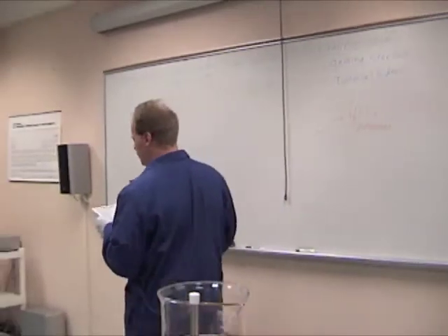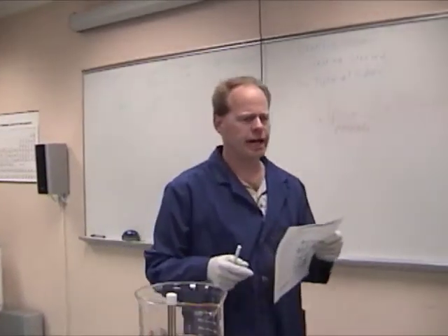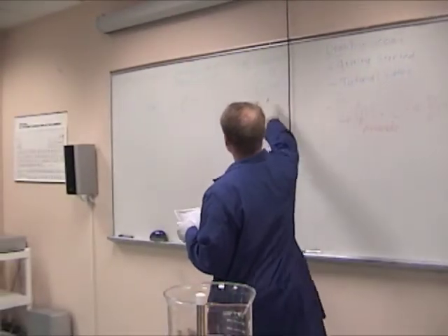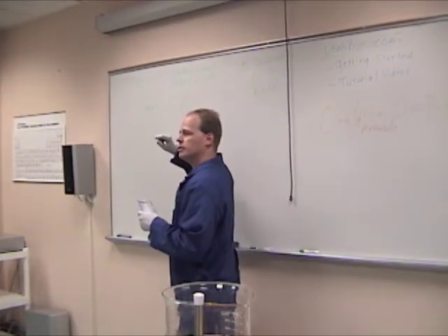Let's learn about this. So I've got everything I need. I've got some catalyst. I've got some cups. Pull those out here in a second. And I've got to make this solution because this is my baking soda, if you will, to make my volcano.